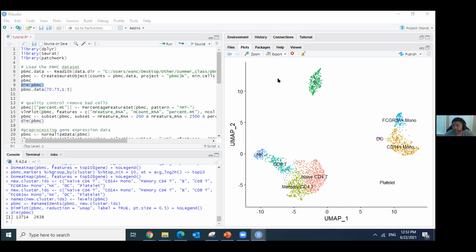Yes, thank you, Changlin. Yeah, cool. So I think today is a great introduction to single cell RNA sequencing, the experiment, processing and analysis. Definitely you will share the course. The key idea here is that today we have maybe the largest amount of coding compared to the past lectures, but still these are all well organized functions. If you apply it to one data set, you will apply it to the second one the same way, just changing several parameters like the input data, and the whole pipeline will stay the same.